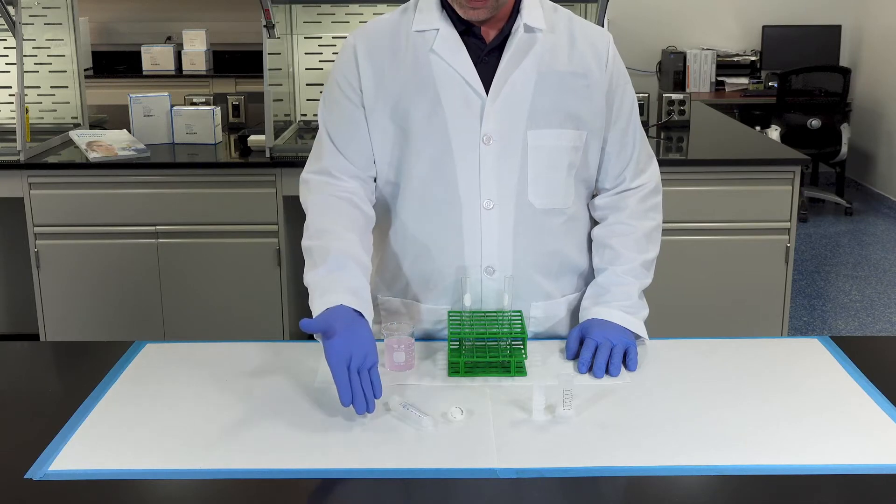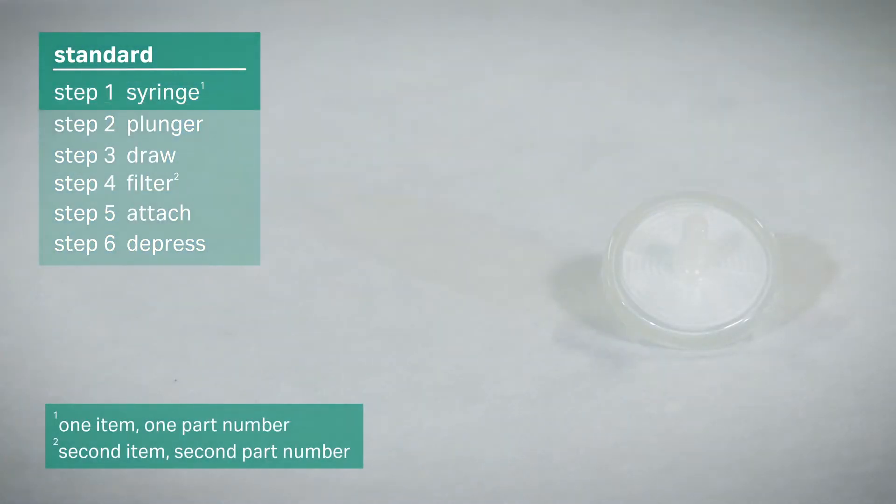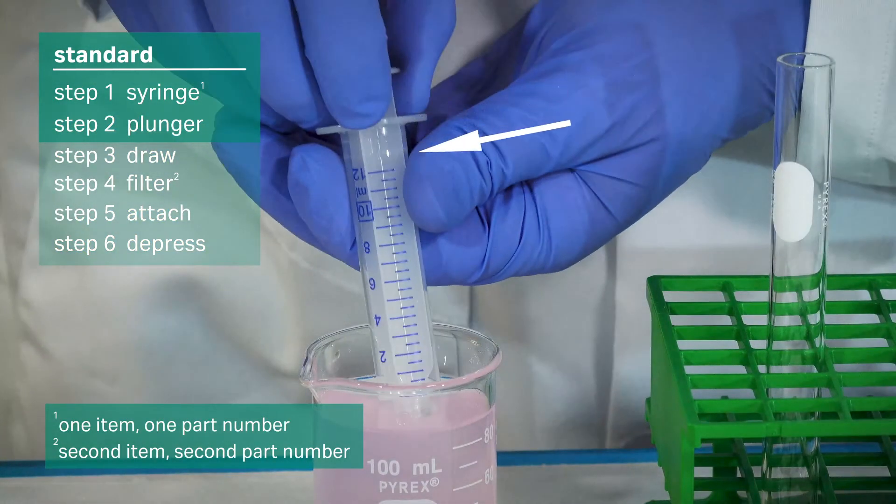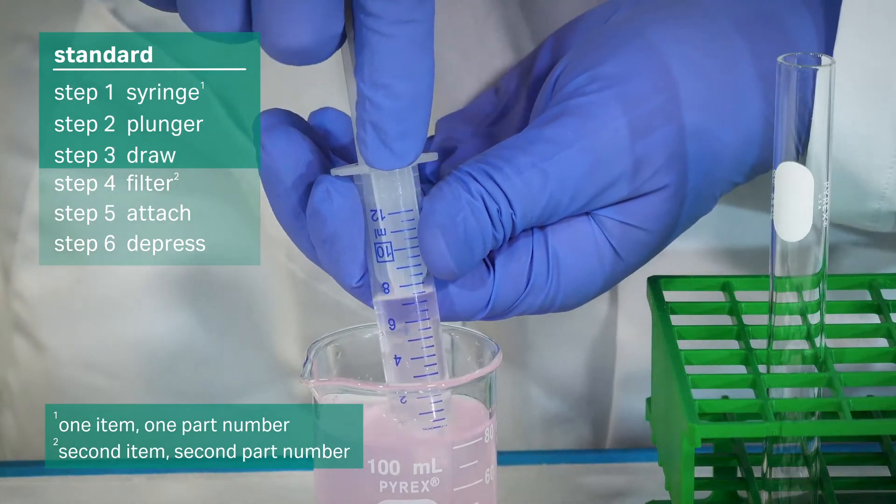First, let's look at the standard syringe and syringe filter. Retrieve your standard syringe. Begin with a plunger inside the syringe barrel. Draw the liquid to be filtered into the syringe barrel.